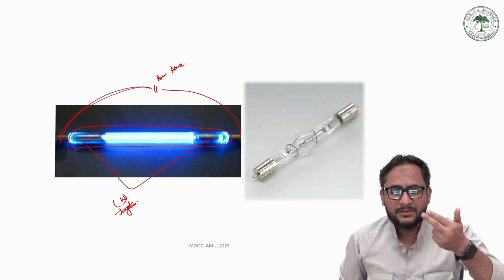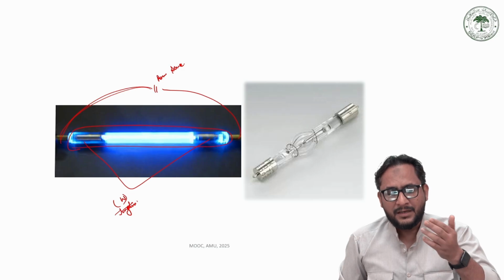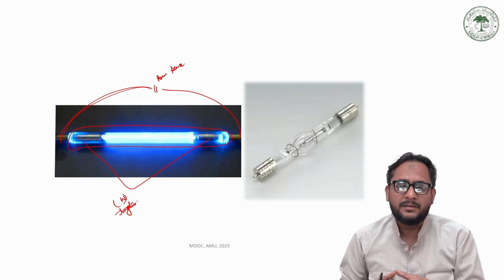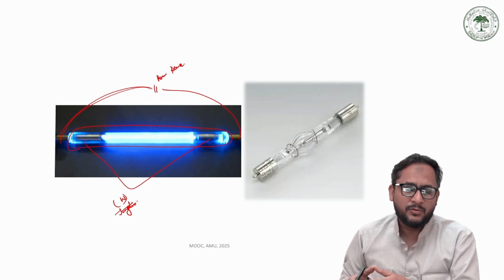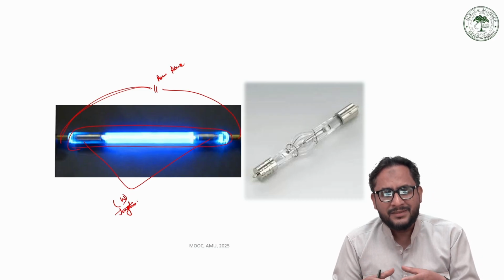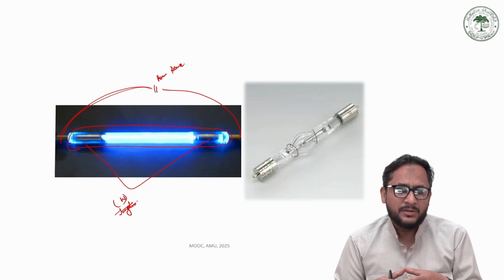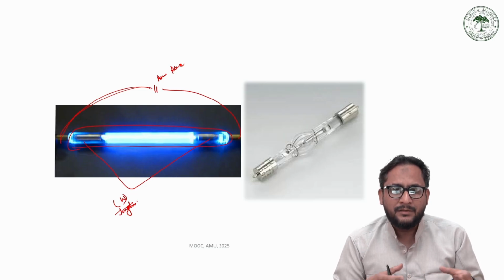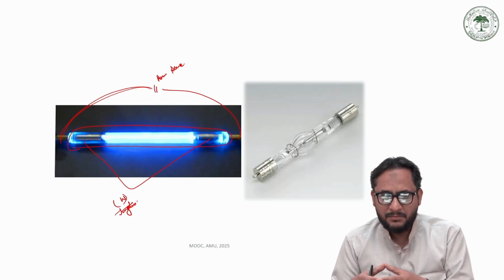And when the electrons are excited upon absorption of this light and they return back, they emit light radiation that is detected to complete the spectroscopic analysis and to study the sample in detail. Both quantitative analysis and qualitative analysis can be done.